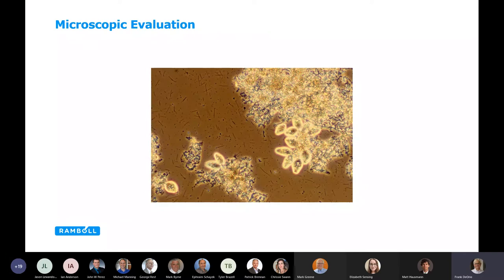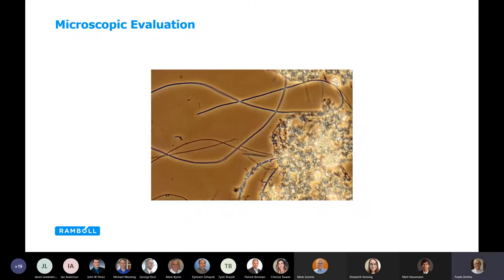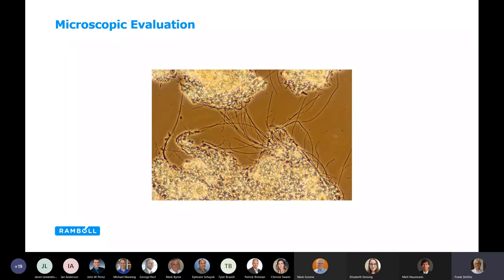Here's a dispersed flock — we don't see much inner flock bridging, we see some higher life forms, and pieces of filaments. This particular biomass is under stress. It will not settle that well, and you'll pick up particles in the effluent. Here's another view showing filaments starting to form, with decent flock structure. You can see different types of filaments by identifying their shape, size — and we know what conditions they grow under, all from the guru's literature. Here's another where filaments are starting to proliferate — excessive, at a point where they're going to start inhibiting settling.